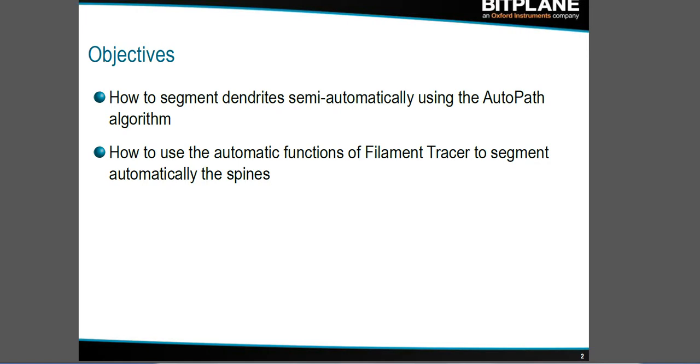Our objectives are to learn how to segment dendrites using the AutoPath algorithm and how to use the automatic functions of filament tracer to segment automatically the spines of such dendrites.